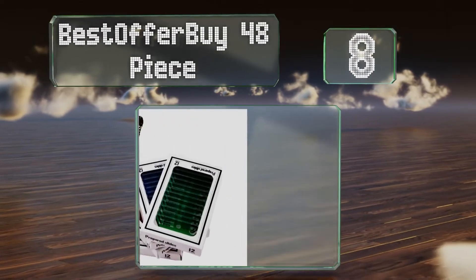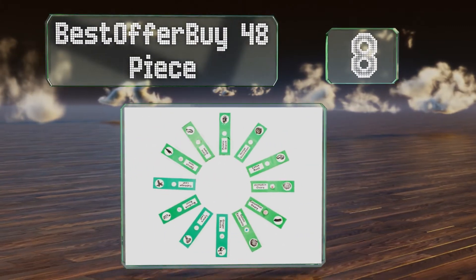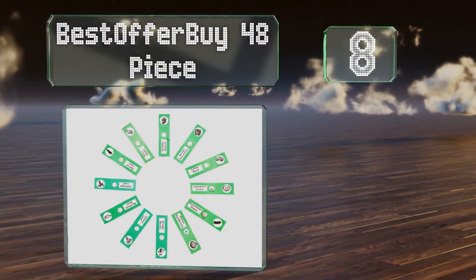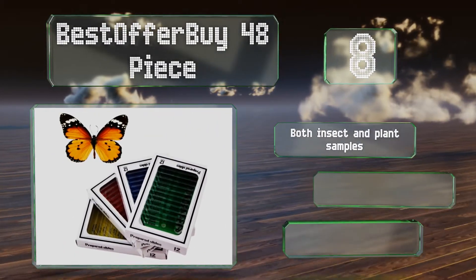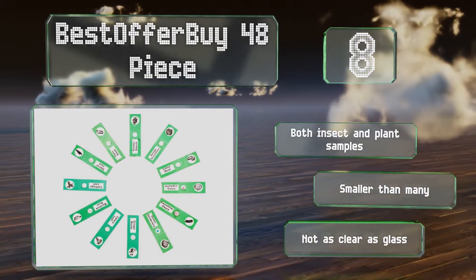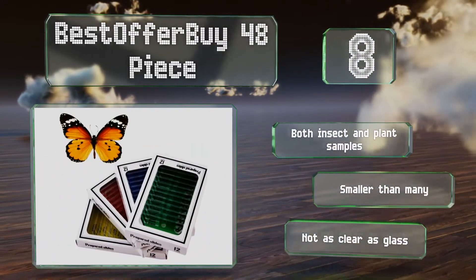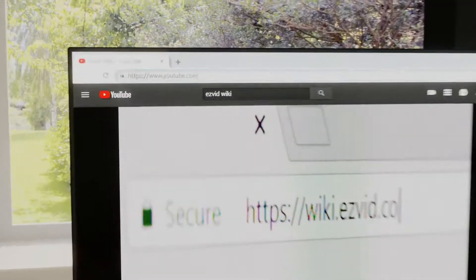Coming in at number eight, the Best Offer 48-piece comes with four boxes of 12 slides each, all made from plastic for safe handling. It also includes a bonus random butterfly specimen. It contains both insect and plant samples; however, they are smaller than many and not as clear as glass.